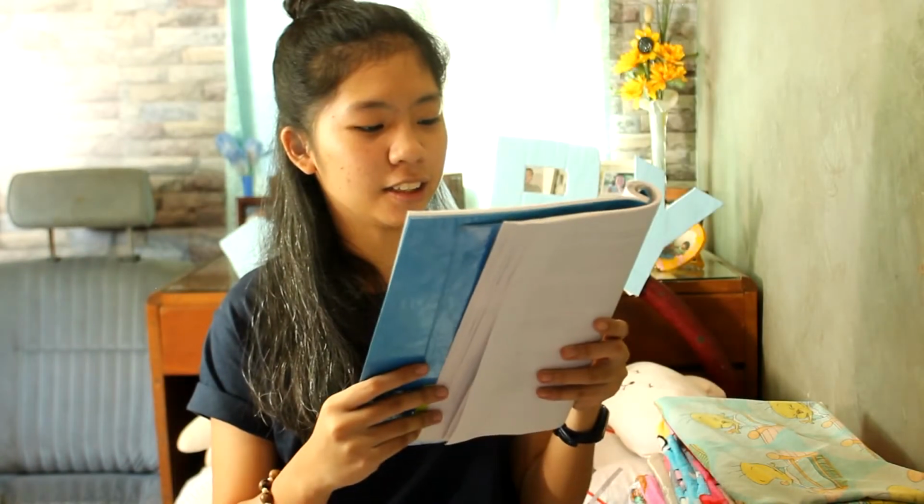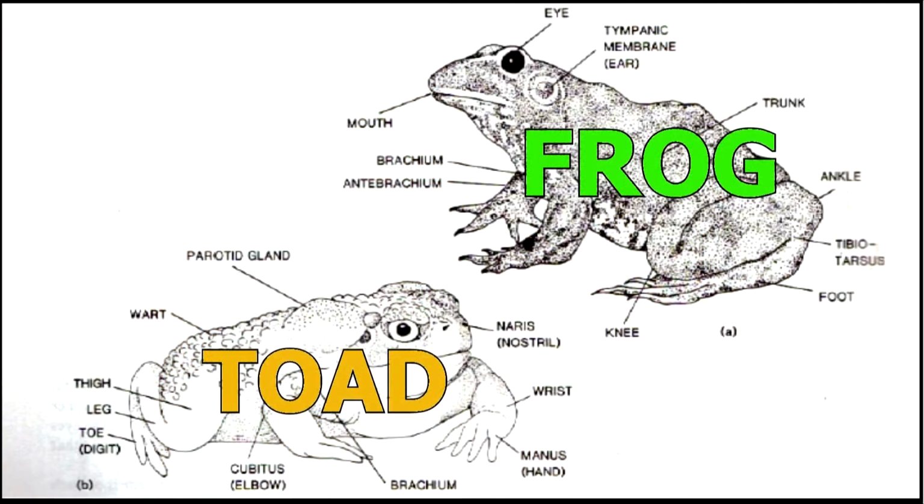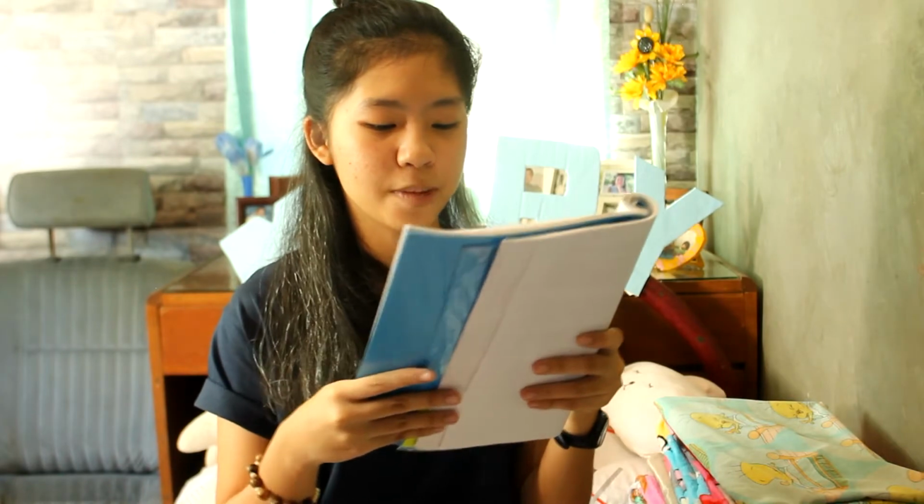Okay, so next is note the external differences of frogs and toads. Okay, so here's a photo of the difference of the frog and the toad. Charan! Yeah, draw and label the parts of the two specimens with proper magnification. Kana siya sa among experiment. Charan! Okay. Okay, so now maka-tag differentiate na ta sa frog ug sa toad.